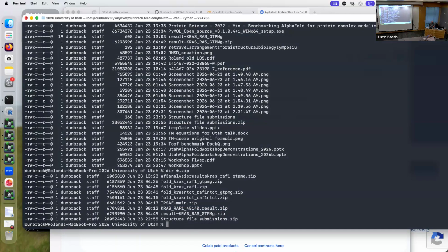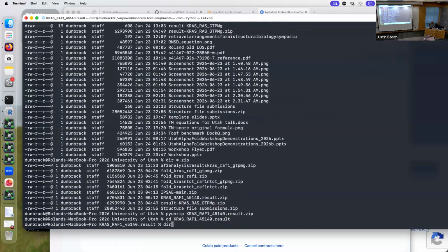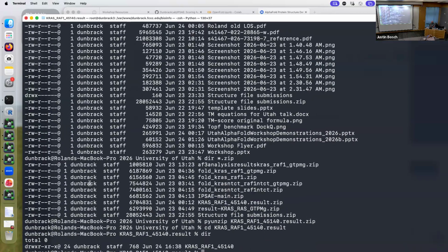No, apparently I don't have it right here. So I'm going to unzip it. And I just change to that directory. It's bigger.